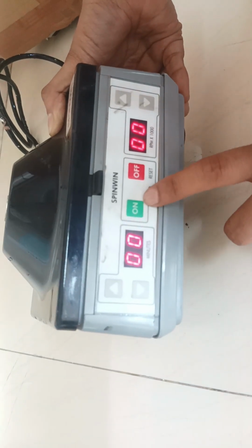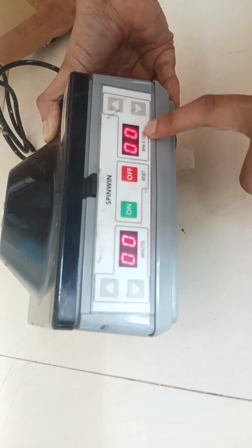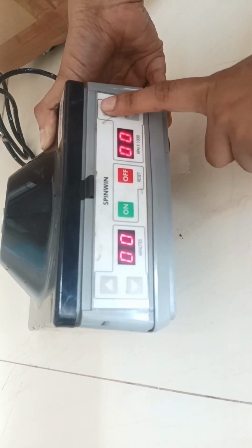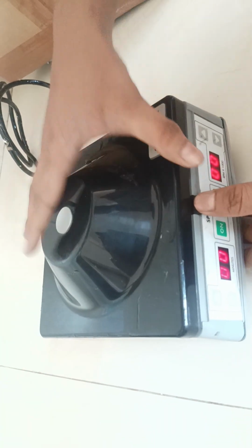Now these are the on and off buttons, and here is RPM into 1000. What is RPM? Revolutions per minute, into 1000. So this many rotations per minute will occur, and you can increase or decrease the RPM with the help of these two buttons. Now let me show you the internal structure of it.